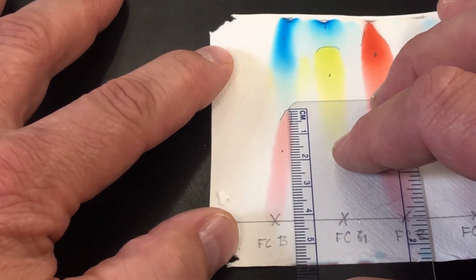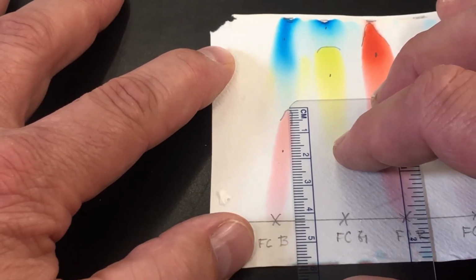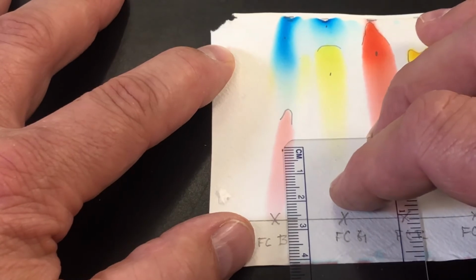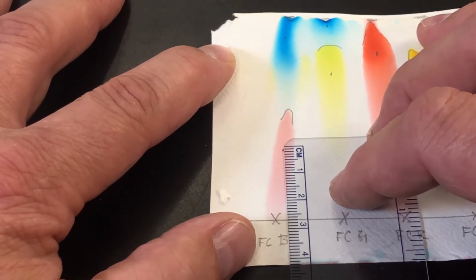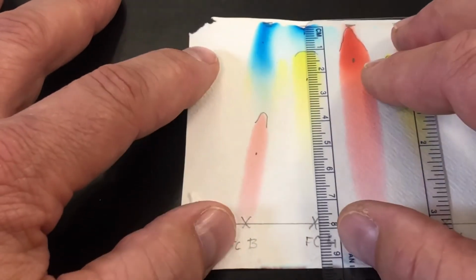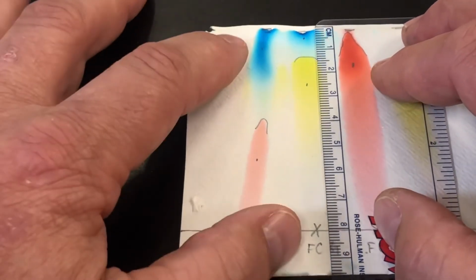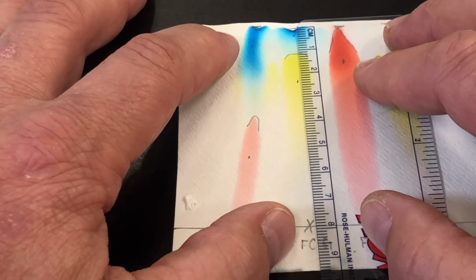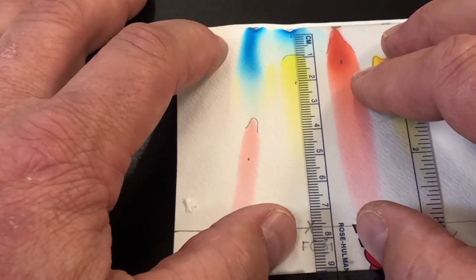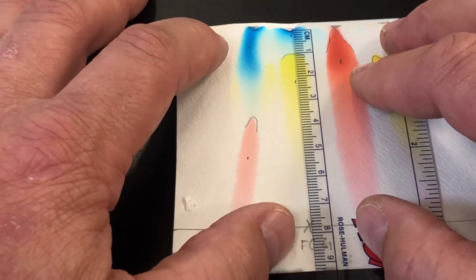The little red here is, we're going to say 4.20. That center mass, if we did the center mass instead, is a 2.70. Again, the blue over here on FC food coloring green, the total amount went, we were going to say 7.90. The tip is going to be 7.90.